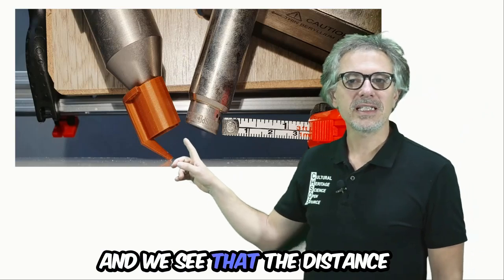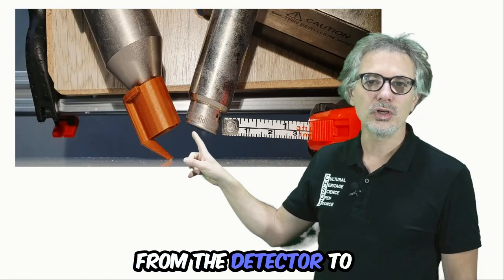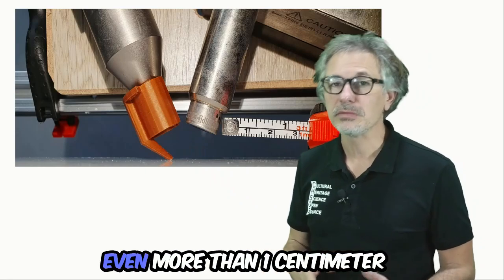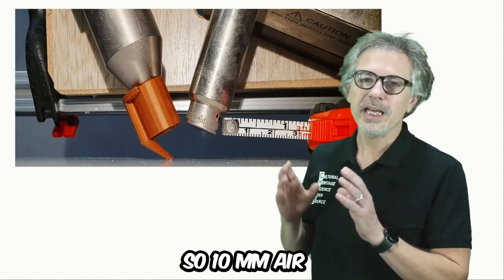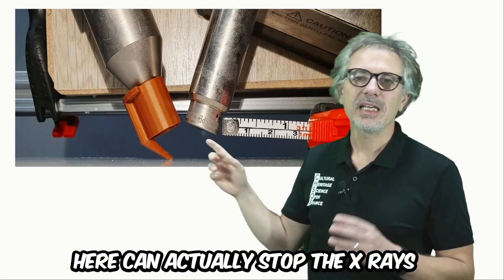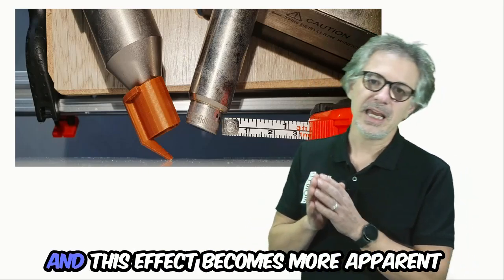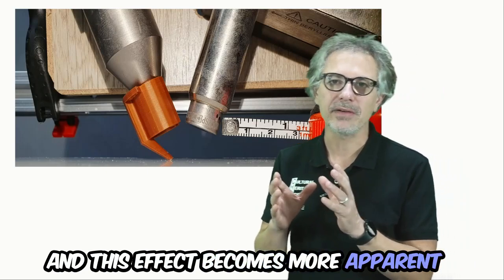We see that the distance from the detector to the target is a bit more than 1 centimeter, so about 10 millimeters.